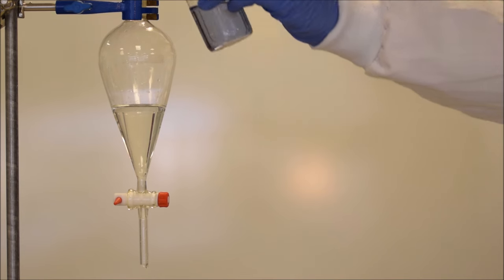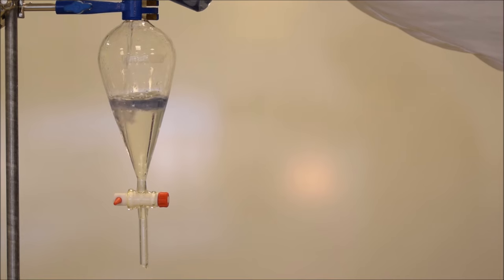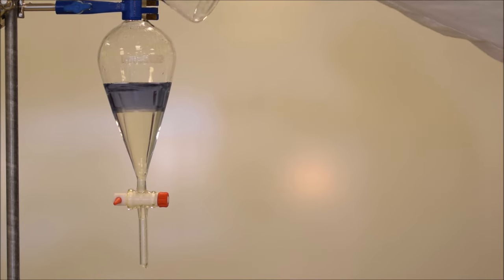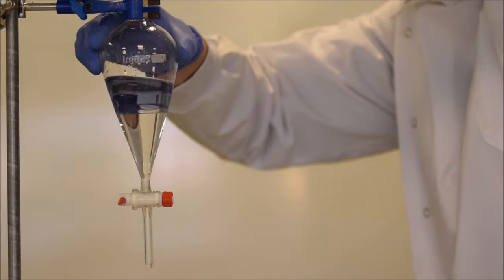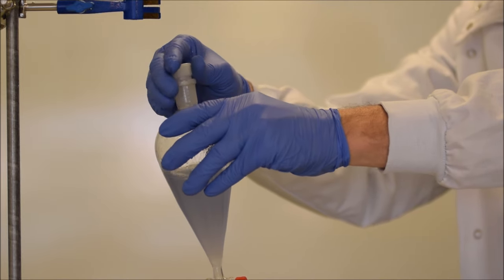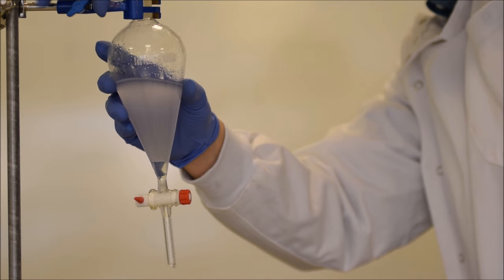In my hand, I have a solution in methyl tert-butyl ether, which of course is lighter than water, so this time it's going to sit on top. And let's have a look at one or two other aspects of doing a successful separation. Well, we put our two layers in, and same as last time, we're going to put a stopper in, and we're going to shake them. So again, sped up, vent, shake, vent, shake, and clamp it again. This time the two layers are much, much slower to separate.